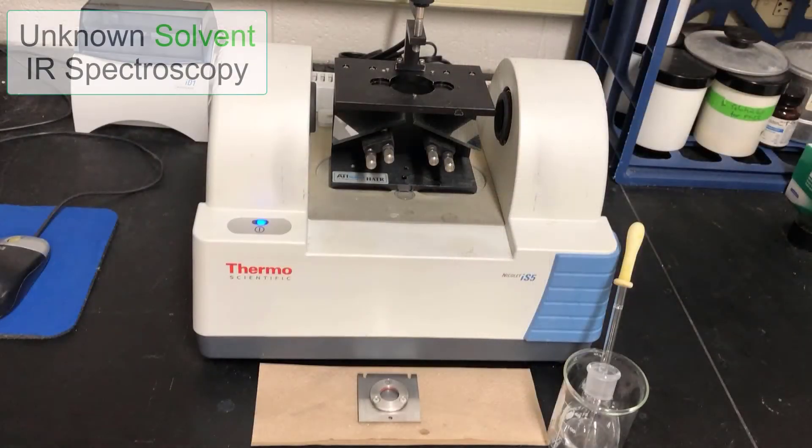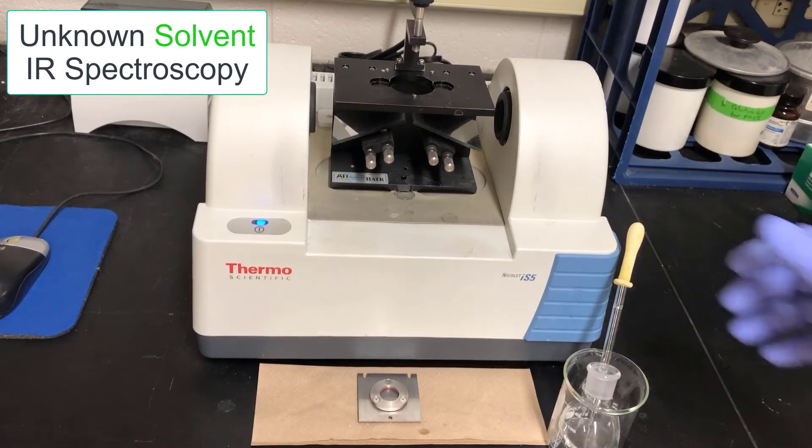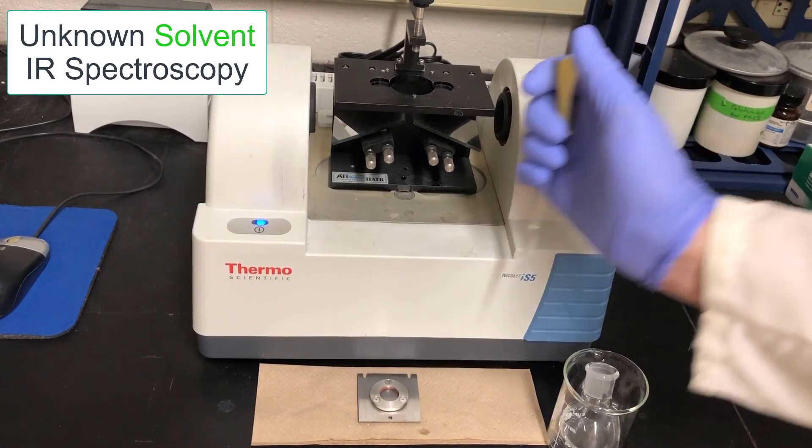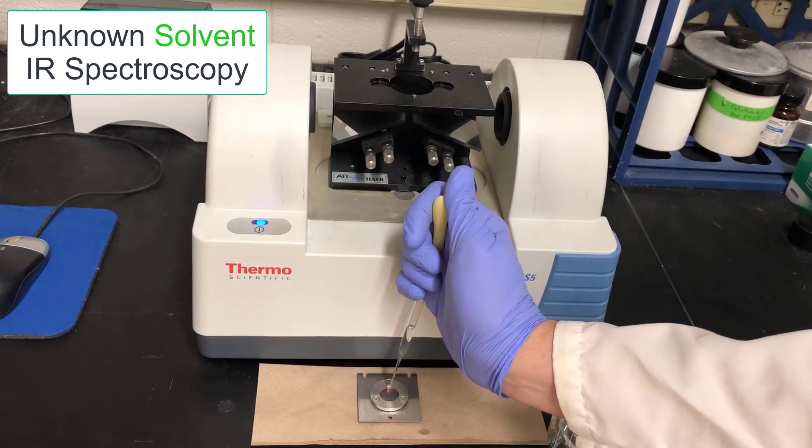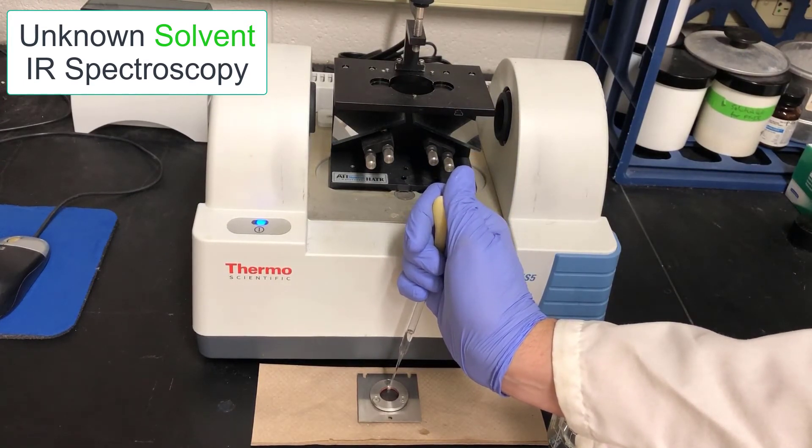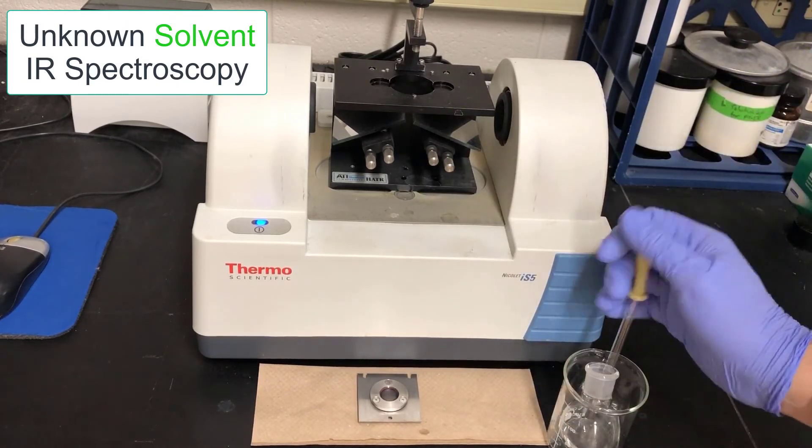Now I'll analyze the unknown solvent by IR spectroscopy. Acquiring IR data has been described in previous videos, but here with the solvents it's just a little different in that these are very volatile materials and if you only put a little bit in the well it'll probably evaporate before you can acquire a spectrum on it.